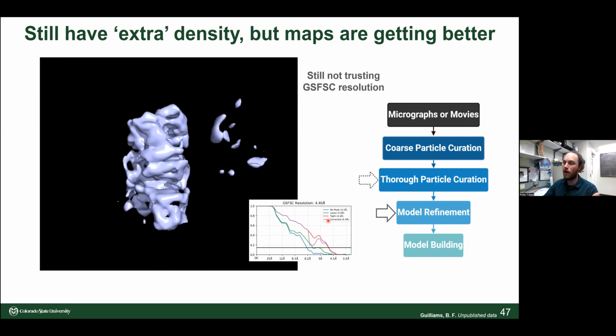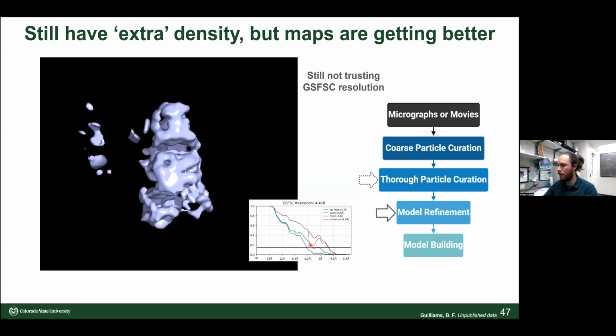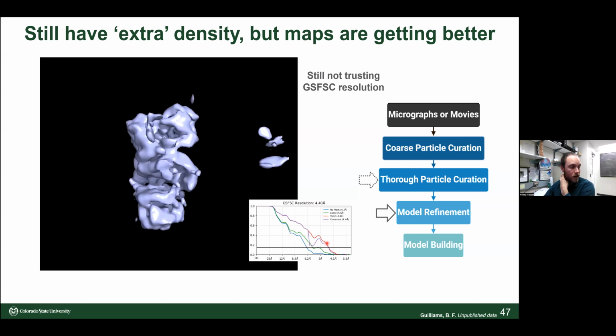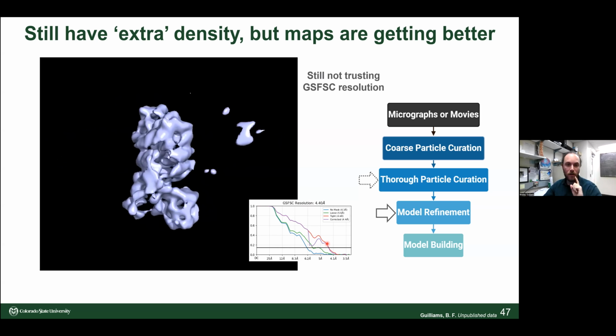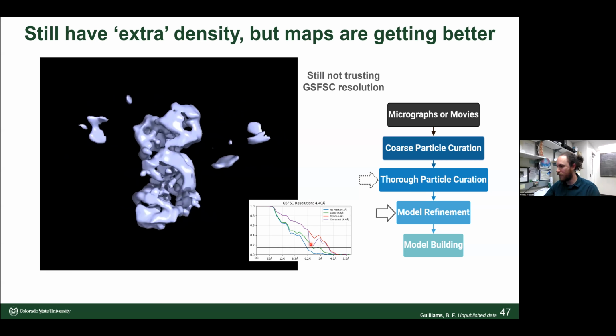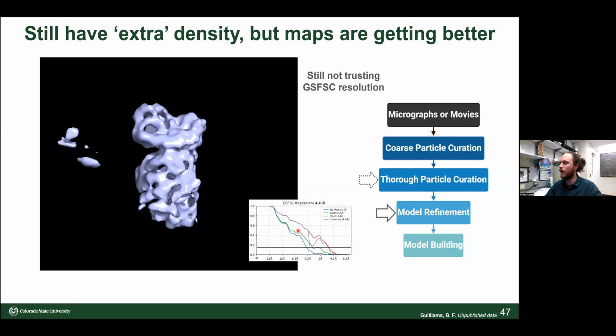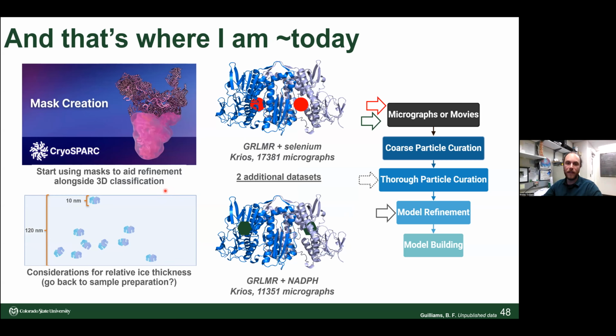I'm still very wary to trust this FSC, this resolution that it's telling me. In fact, I learned recently at the CryoSPARC workshop that Michael was talking about in the intro, I was able to attend for about the first day of that, that a shape like this tells me there's something wrong with my mask, or something's too tight, maybe, right? I don't know anything about masks, I learned that last week. So after this, I'm probably going to eat some lunch, and then I'm going to look at this cool mask creation video posted by CryoSPARC.